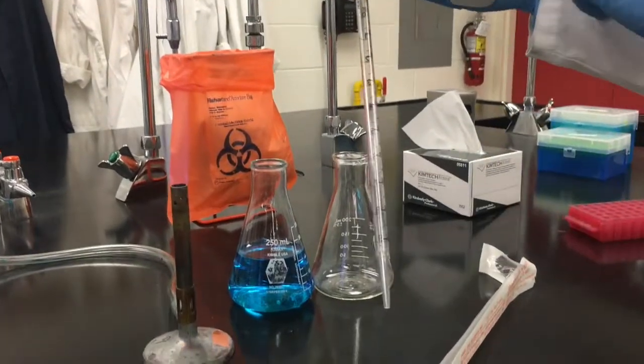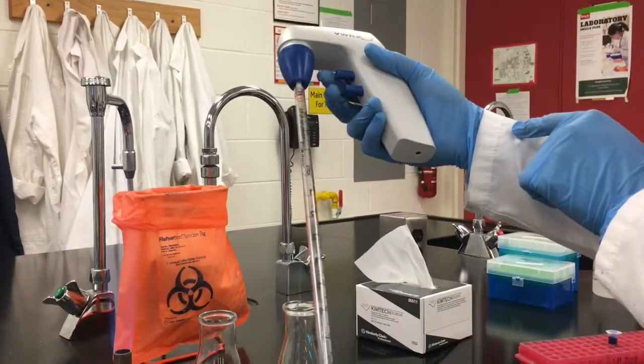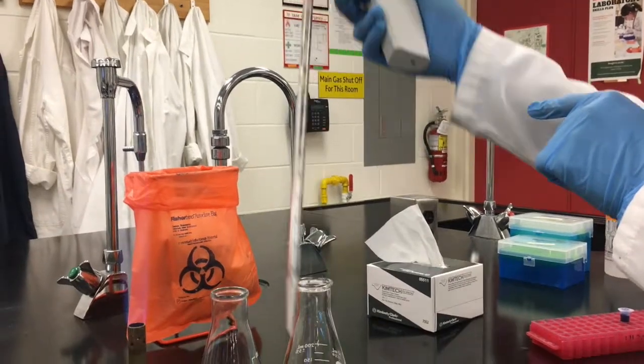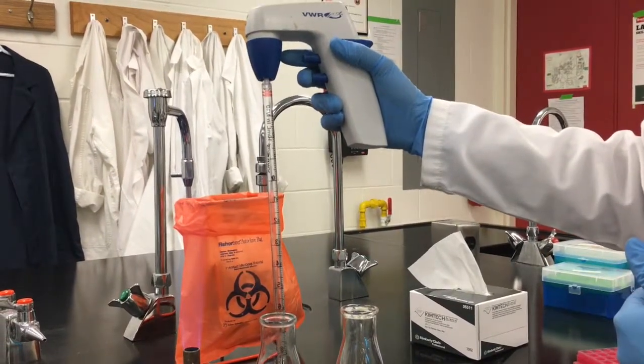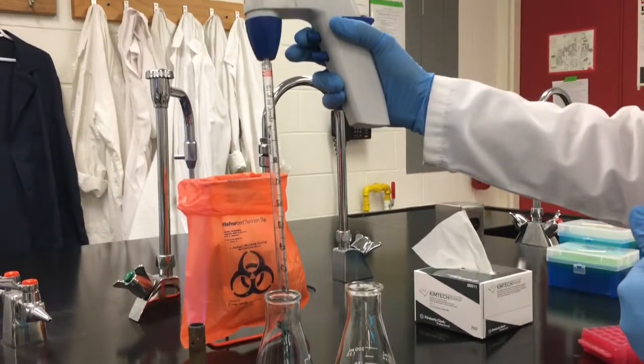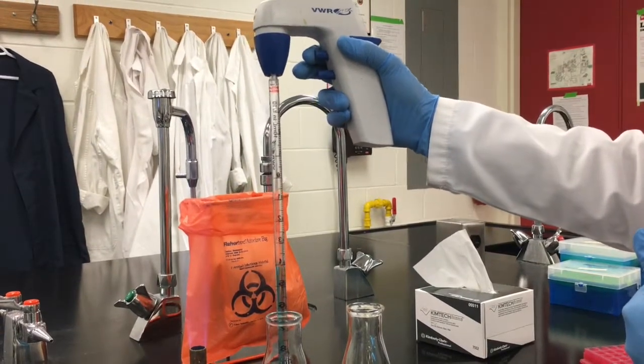Electronic pipetter has two buttons, one for drawing up the liquid and one for expelling the liquid. Always maintain the pipette in a vertical position to prevent any liquid from entering the pipetter. Insert the tip into your solution and press the top button to draw it up into the pipette.